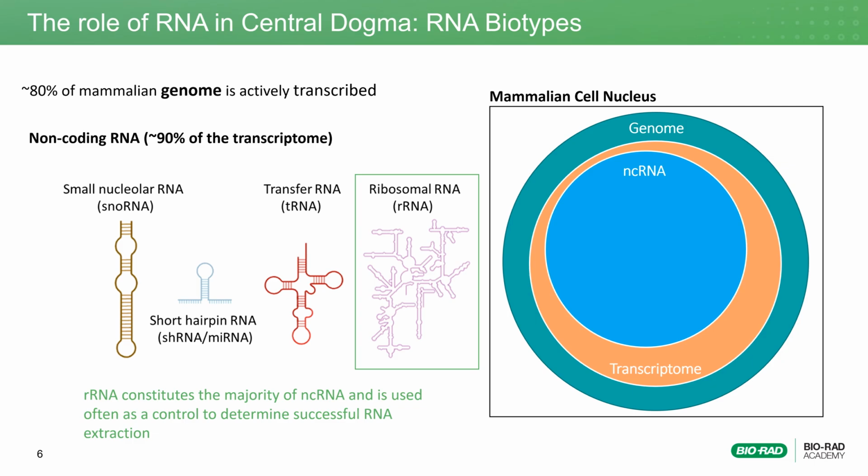Because of their overwhelmingly and steady presence within a cell, quantifying ribosomal RNAs is used as a positive control during RNA extraction. However, after RNA isolation, scientists utilizing RT-qPCR may utilize a ribosomal RNA clearance step to reduce their inherent noise and enrich the signal from other RNA transcripts of interest.